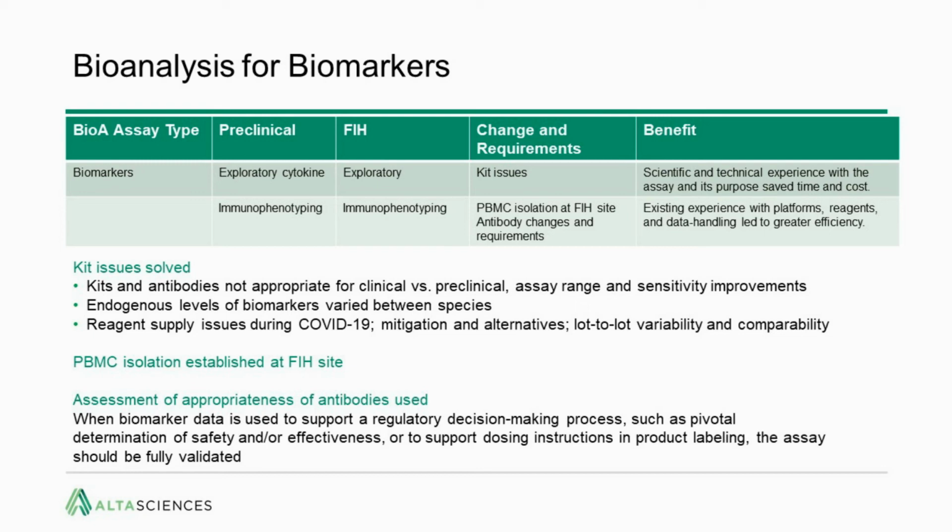Immunophenotyping was also included preclinically and in first in human. Challenges included PBMC isolation at the clinical site, as well as antibody changes and requirements. The benefit was existing experience with platforms, reagents, and data handling led to greater efficiency.